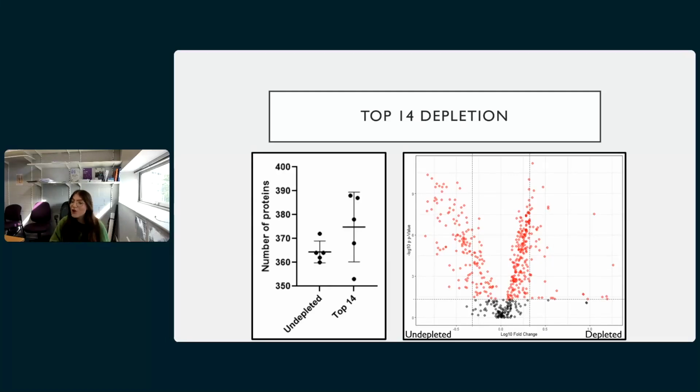So I would not recommend using a serum or plasma intended depletion resin or depletion product for proteomic analysis of whole blood spots, as it could and probably would impact the reliability of your results. So the next question would be to discuss depletion of hemoglobin, but that's kind of a work in progress situation that you may hear about in the future.